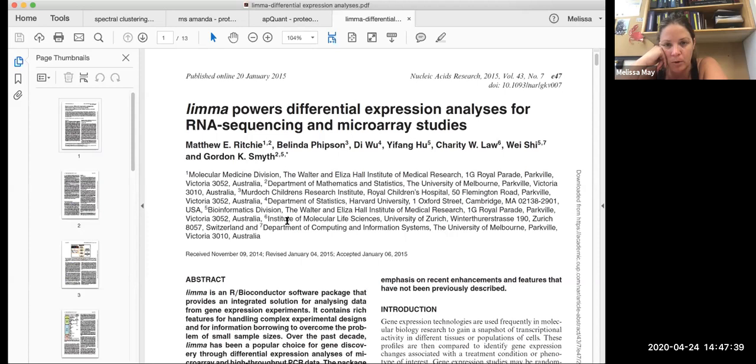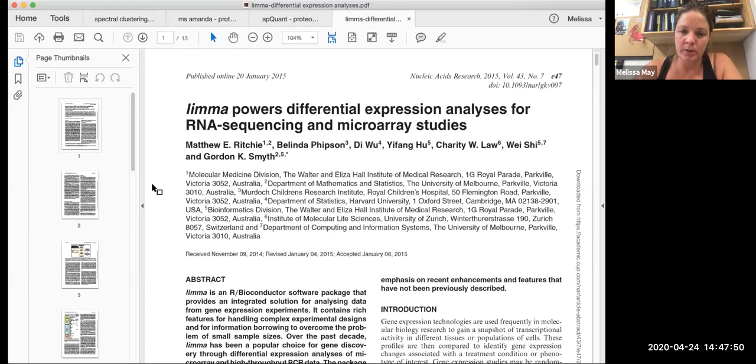So you'll need to go through, once you have all of your samples, filter out data that you don't want, normalize all of your data, log transform it, and then you can actually run the statistical analysis in this. So that is how we do our, I guess, processing of our proteomics data.